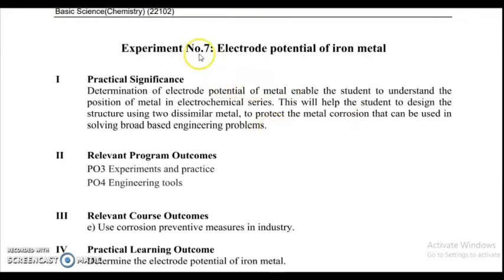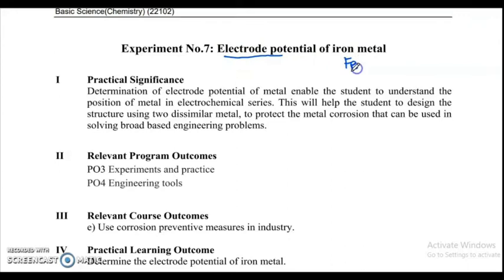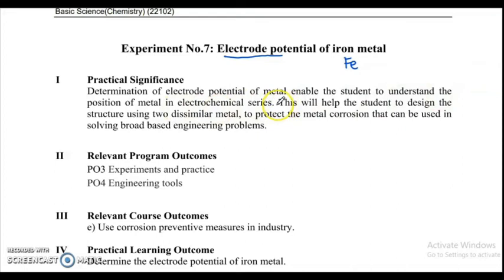Hello students. In this video we are going to see experiment number 7, that is electrode potential of iron metal. In this experiment we are going to determine the electrode potential of iron metal, that is E_Fe metal. The practical significance: determination of electrode potential of metal enables the student to understand the position of metal in the electrochemical series.